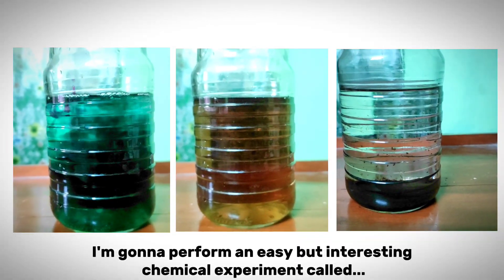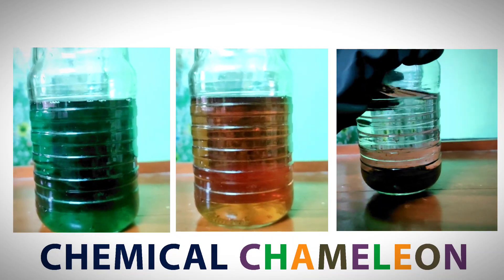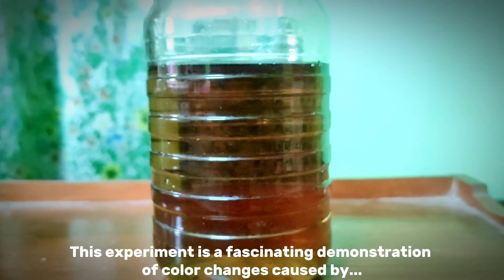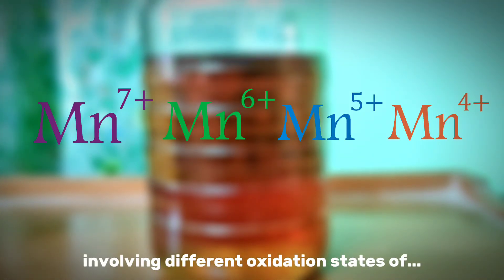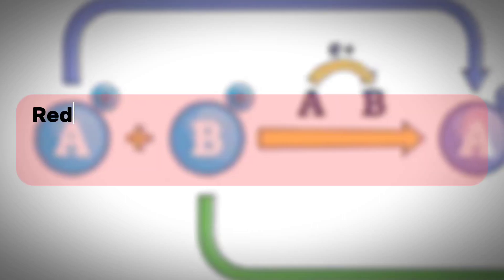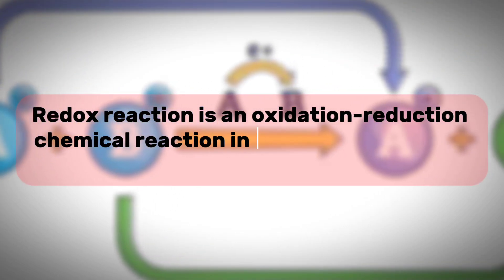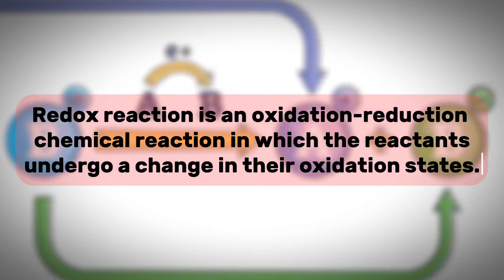Today, I'm going to perform an easy but interesting chemical experiment called chemical chameleon. This experiment is a fascinating demonstration of color changes caused by redox reactions involving different oxidation states of manganese. Now the question comes, what is a redox reaction? Redox reaction is an oxidation-reduction chemical reaction in which the reactants undergo a change in their oxidation states.